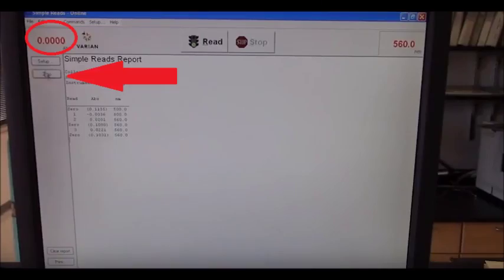Find the red button that says 0. It is highlighted by the red arrow. Click it, it will zero the machine and negate the effect of the water molecules. The absorbance value circled in the left-hand corner should be at or near 0. When you fail to zero the machine, the absorbance values for all the solutions will be incorrect, giving the wrong numbers to plug into the Beer-Lambert law.